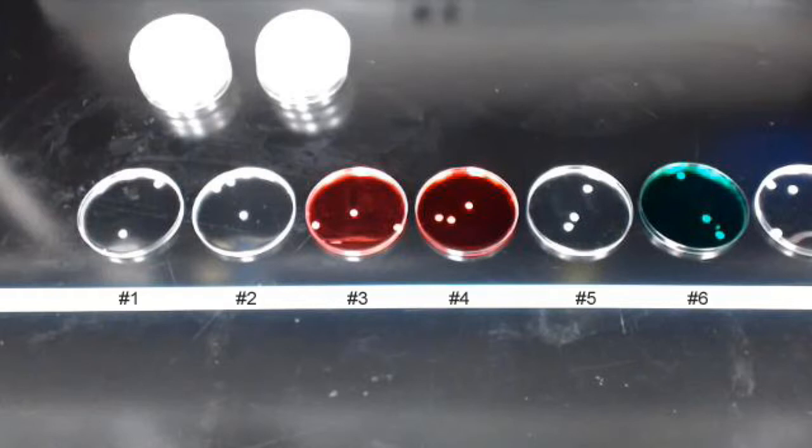In Module 15, we are evaluating the effectiveness of 12 different disinfectants and antiseptics in their ability to inhibit the growth of gram-positive and gram-negative bacteria.